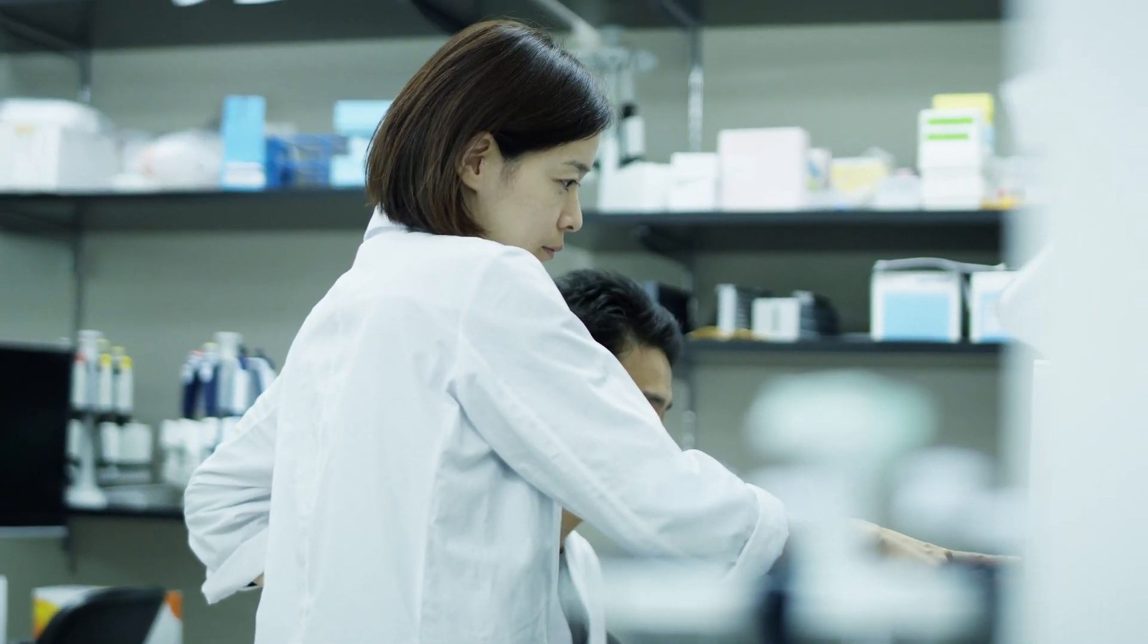We are offering many kinds of applications such as de novo sequencing, RNA sequencing, chip sequencing, and also amplicon sequencing.